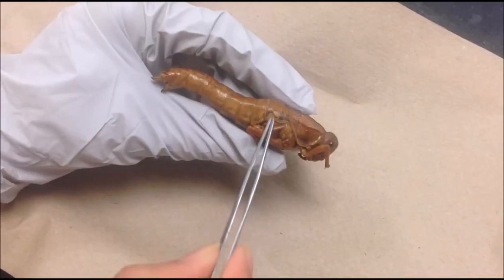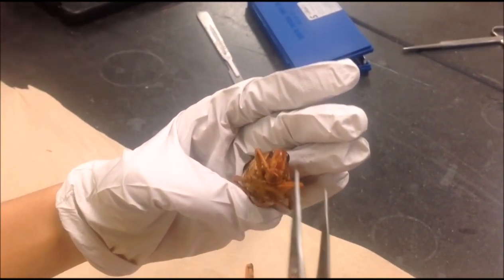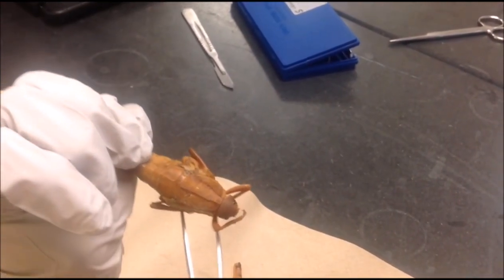This is the tympanic membrane, or the eardrum, of the grasshopper. The grasshopper's head has many small parts, which allow the grasshopper to collect sensory information and eat food.